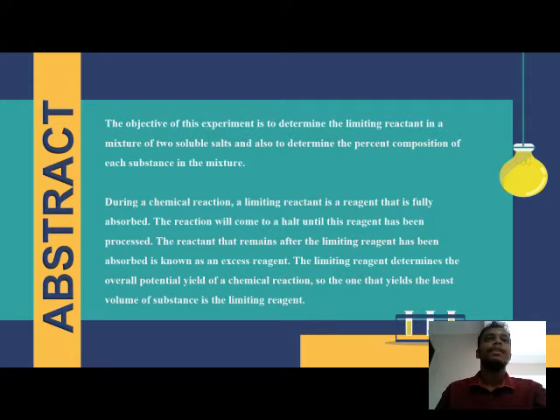I will be presenting the abstract for Lab 5. The objective of this experiment is to determine the limiting reactant in a mixture of two soluble salts and also to determine the percent compositions of each substance in the mixture.